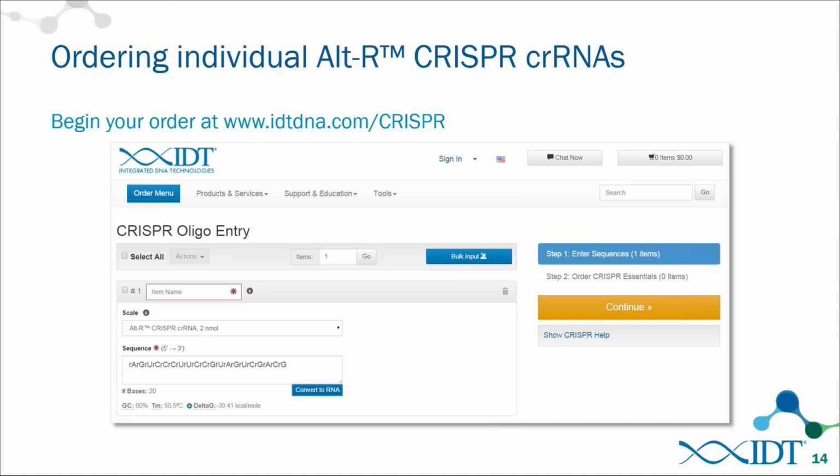And what you'll notice below is that you can directly grab in the sequence box the DNA sequence that you wish to target that is directly adjacent to the PAM site, paste that in, and click the Convert to RNA button, and it will directly convert all the DNA bases to RNA. And then, as I mentioned, there's the 20 nucleotides that you enter. This additional 16 at the 3' end of the crRNA will be automatically appended here in the configurator tool.